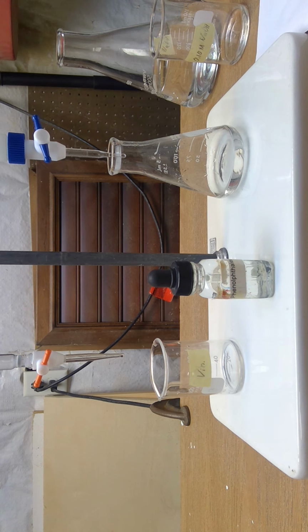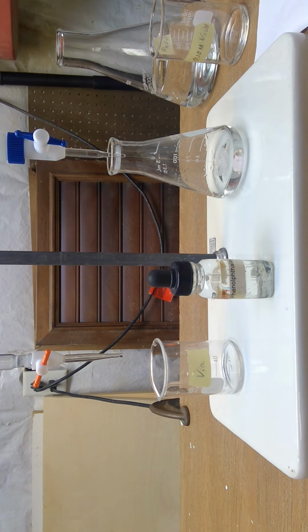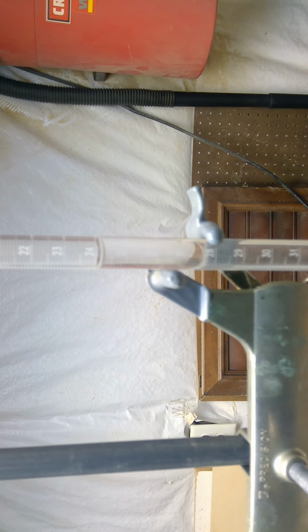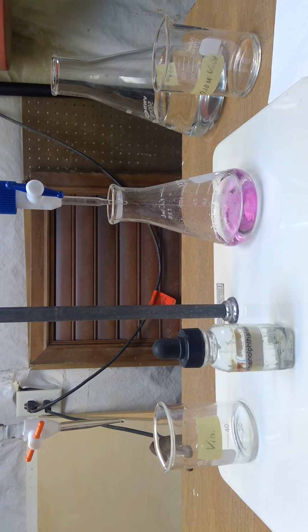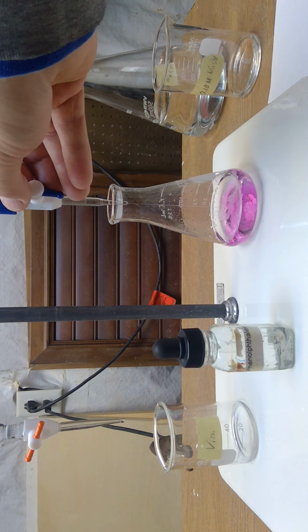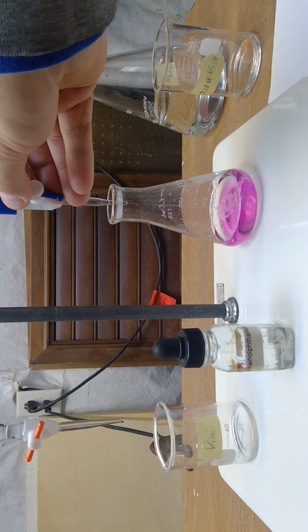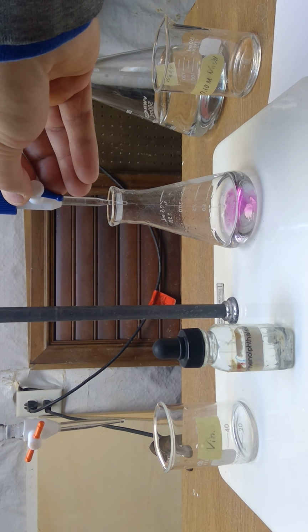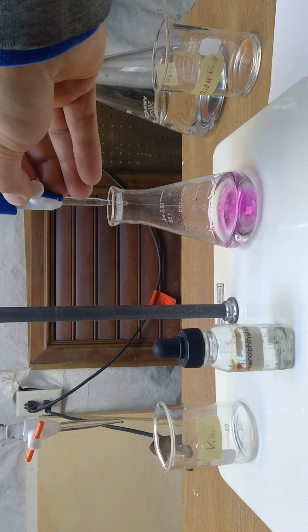Alright, so we're at 20, so we can go to 40 pretty quick. So I'm going to just go ahead and get us started here. And we'll run it down there. So let me show you here. You can see our burette going down pretty quick. There's 30, 31, there's 32, 33, 35, 39. Oop, that's 38, sorry.